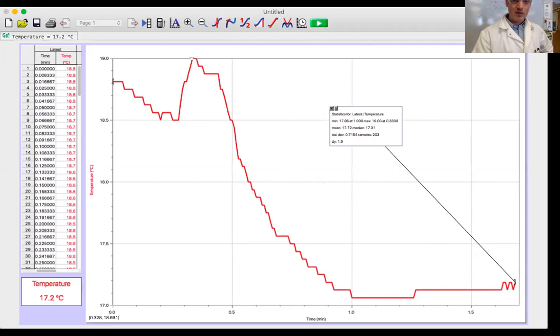That might have been this up here at the very start. The temperature looks kind of weird because it was room temperature, and then I put it into the container, so we're actually going to use max and min for our change in temperature. Okay, so I'm just going to write those down on the board while I have that open.